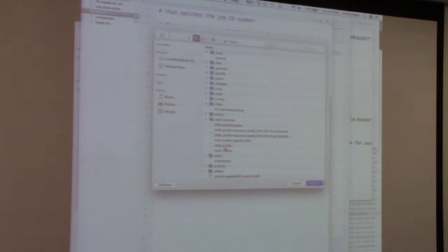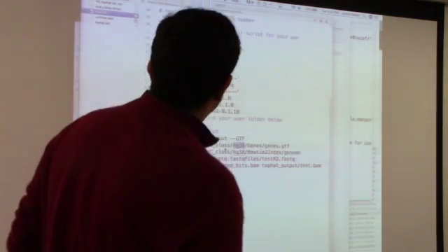So if you don't have .bash profile, then you just go to terminal and create one. The way to create a bash profile, and you're already in the home directory, you just say touch .bash_profile and boom, done. Now if you go here and you click open, you should be able to see that bash profile. Now here, you just add that one line, the one that I was showing, the alias. Can you show that line again? Yes, so once you have your bash profile there, then all you do is add this.